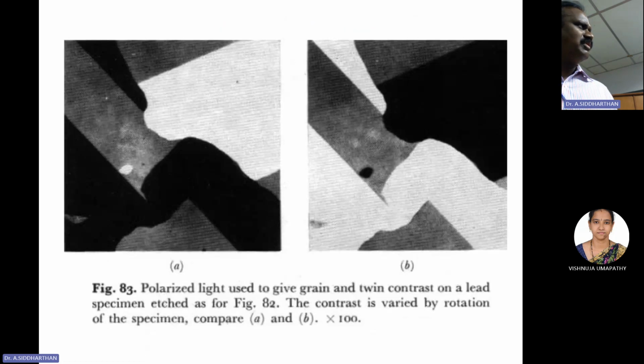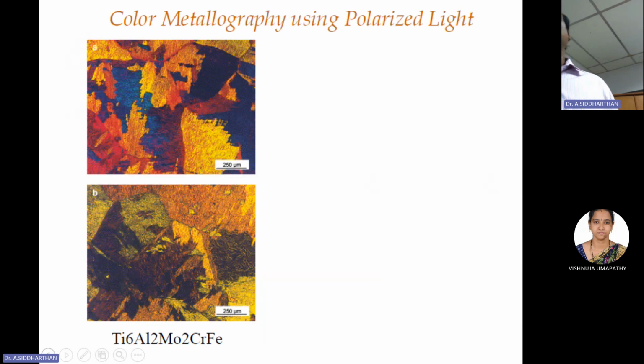Okay, so what's the beauty of this technique? Which type of crystal system? What is the alloy? Based on titanium. What is the crystal structure of this alloy? Anisotropic. They are not cubic systems, so it is not BCC or FCC. It will have non-cubic structures, so it will have HCP structures also. Titanium alpha, beta, brass alpha, beta, all these correspond to non-isotropic structures.